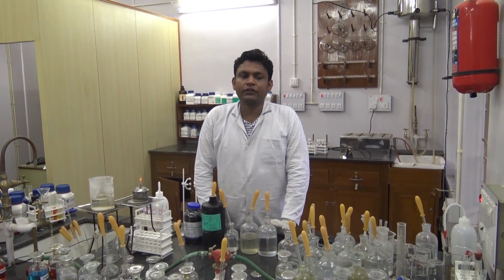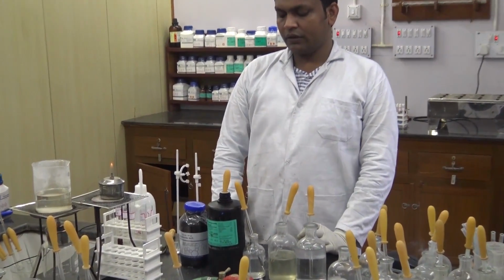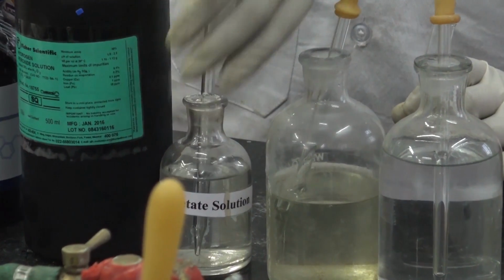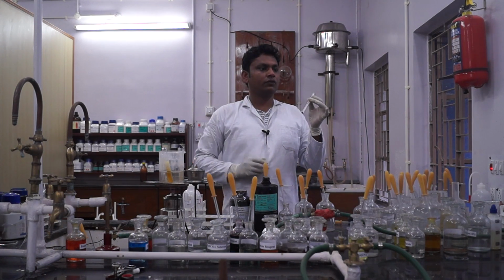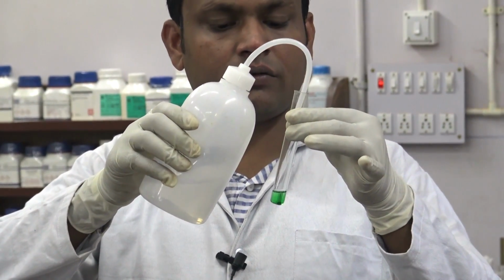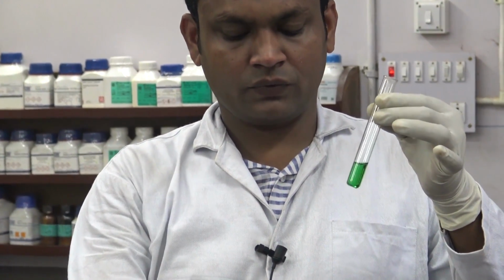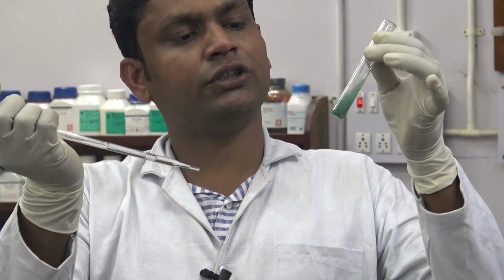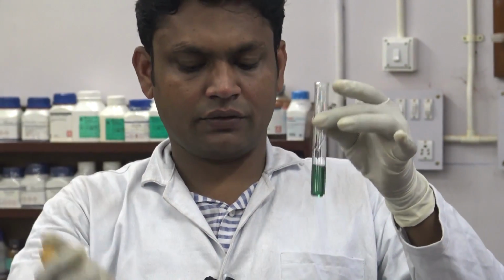Now we will test for the confirmatory test of chromium, that is lead acetate test. For this we require sample, H2O2, lead acetate solution, NaOH solution. For the lead acetate test, we will dissolve the sample in distilled water. Then add few drops of sodium hydroxide to it. At first precipitation occurs, then add excess of NaOH to dissolve the precipitate.